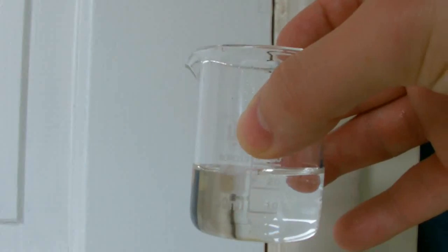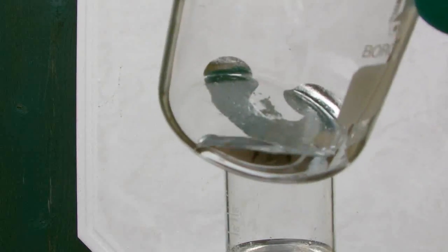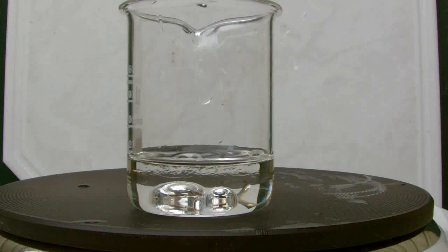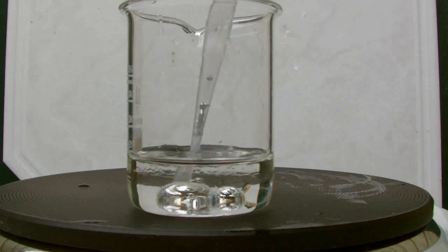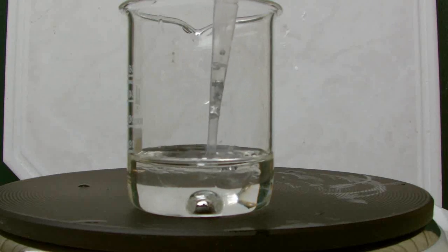Now that it's cooled down, I'm going to take some of my gallium and drop it in. Notice how the gallium forms into a ball shape — that's the gallium reacting with the sulfuric acid, creating gallium sulfate, which causes the surface tension to pull the gallium up into a sphere.